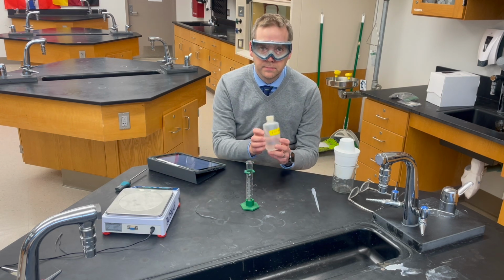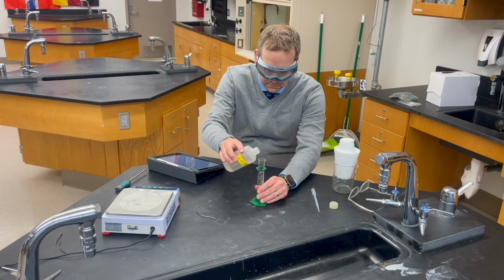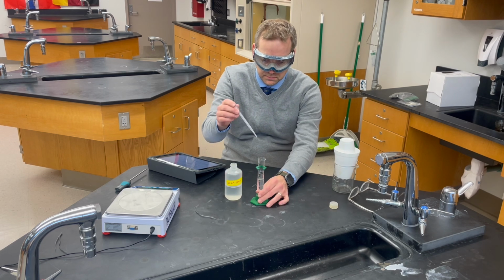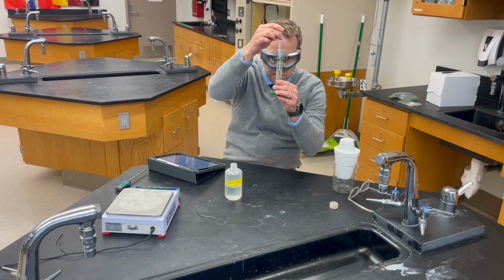Next, I'm going to locate my 2 molar hydrochloric acid, and I'm going to measure out exactly 20.0 milliliters of the hydrochloric acid. I'm going to use this little plastic pipette next to me in order to get exactly 20.0, not 20.1 or 19.9, 20.0.